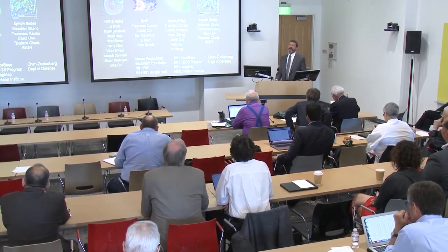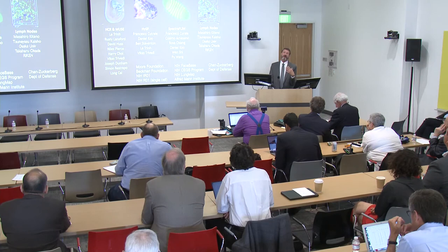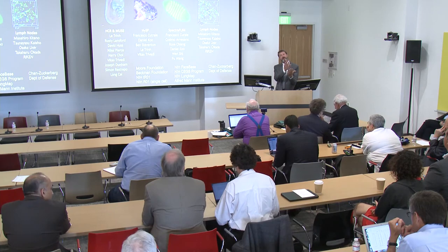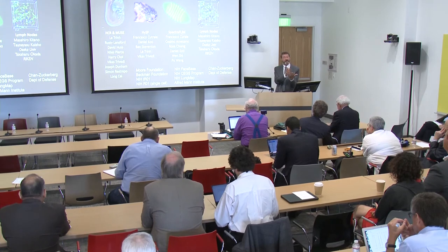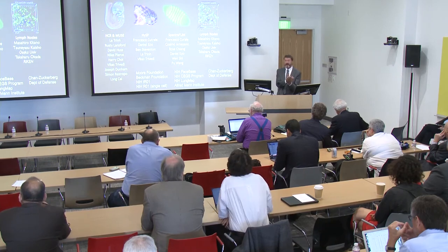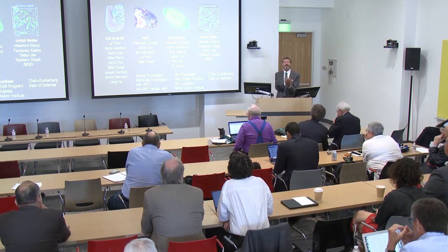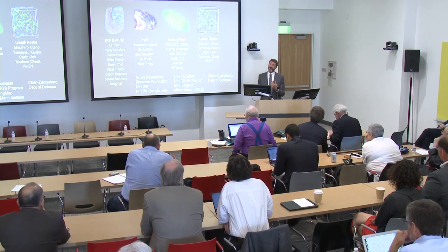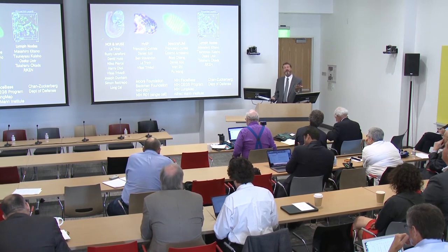Yes, and so that's exactly where we're going. Some of the autofluorescent signals are maintained after the cells are fixed. We can then take the live image, fix them, and then do the whole mount HCR and other assays, and use the autofluorescent signals that are preserved in the fixed state to re-register. And we're just starting to do that. And if I didn't say along the way somewhere that that's the missing bit, that is still the missing bit. We now need to compare the spatial transcriptome work with the spatial metabolic probing that we're doing.